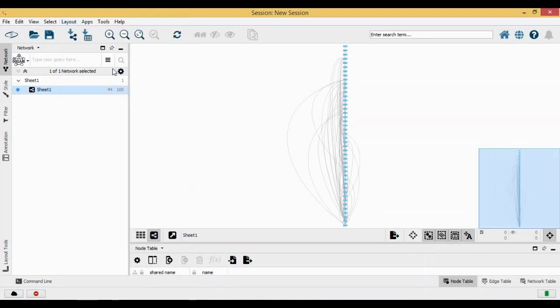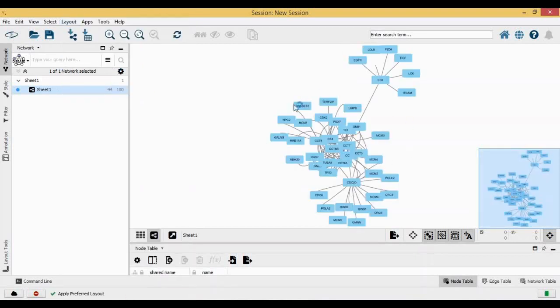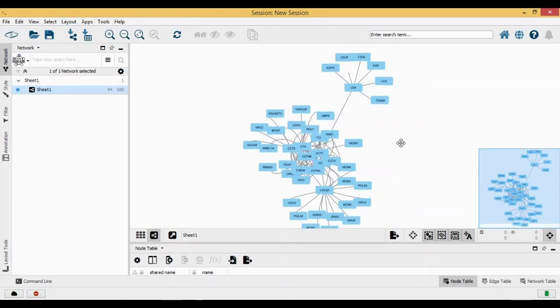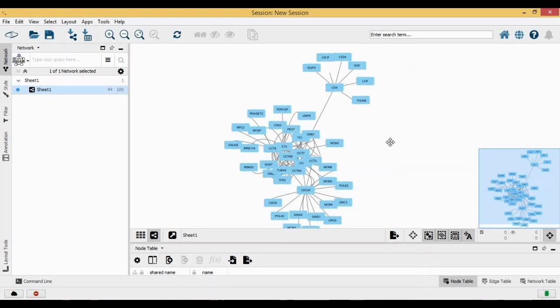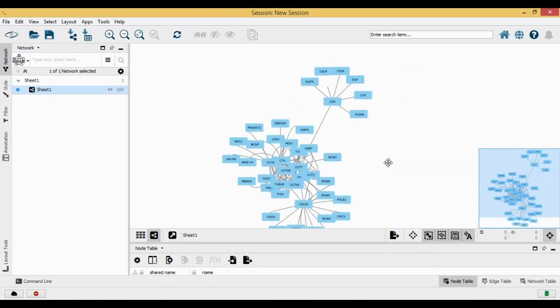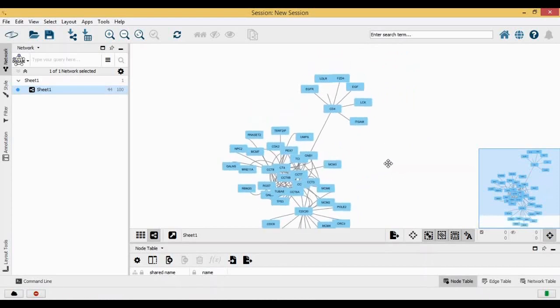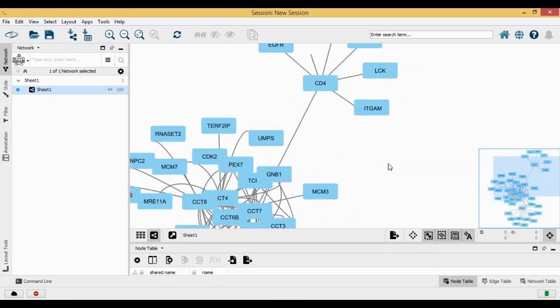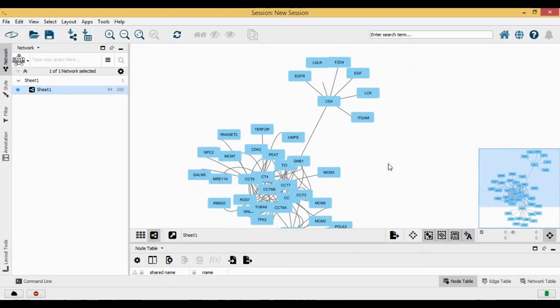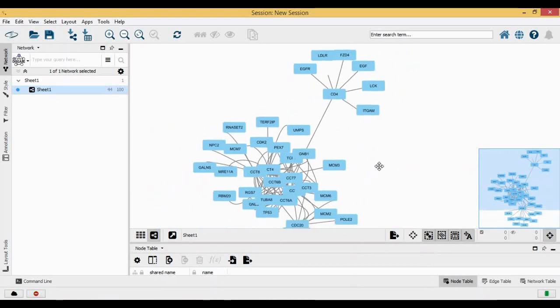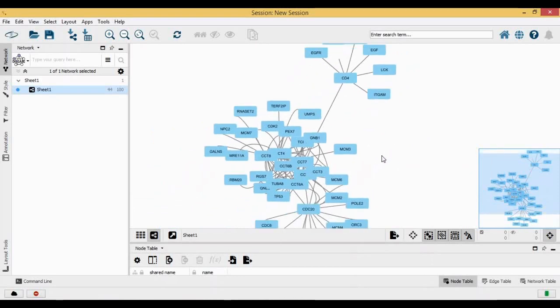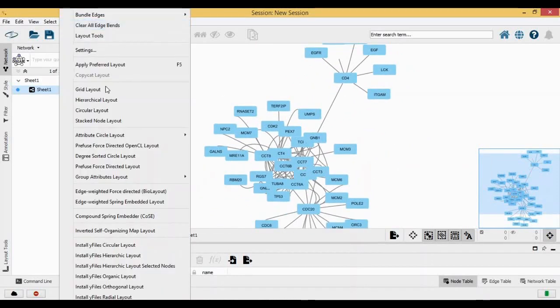My preferred layout is always as it says here, apply preferred layout. This is completely depending upon how your network is and how you want the representation of your network to be. If you feel that using circular layout your network looks better, you can do that.